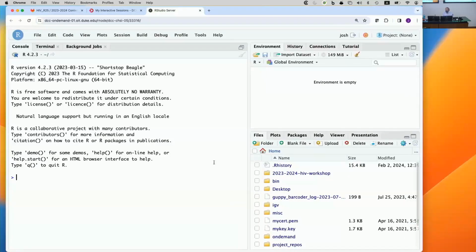So that's the data set that we're going to be working with. And there are a couple of advantages of working with this data set as opposed to, say, human data. One is that the genome is way smaller than the human genome, and so that makes things a little bit faster. And another is that we don't have to worry about patient privacy, because we don't care about that for our fungus. Okay.